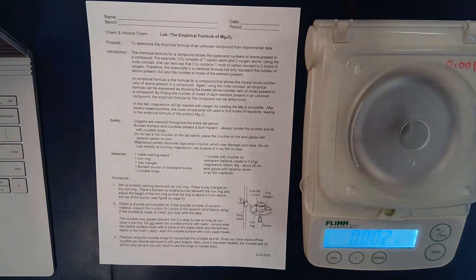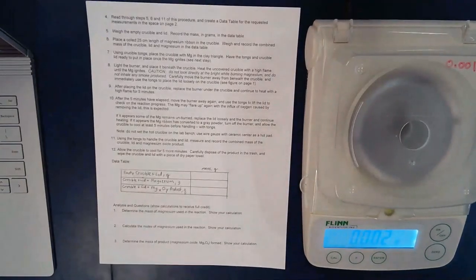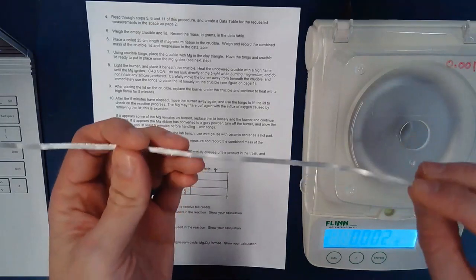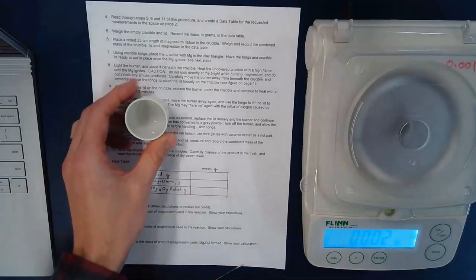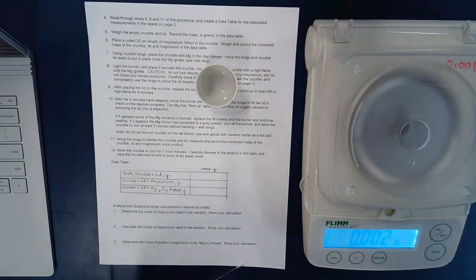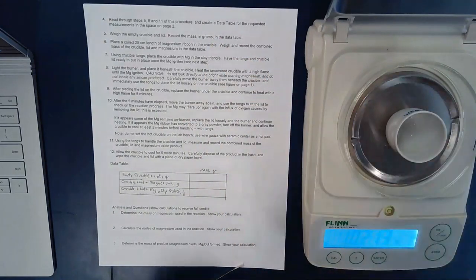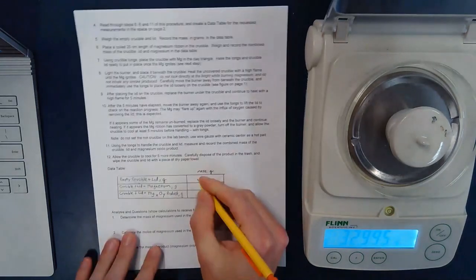Now, I think what we're going to do now is we're going to uncover our data table, and then Mr. McGinnis is going to step in, and he's going to take some mass measurements. Okay, so some of the things we're going to use, in addition to our strip of magnesium, which is a rather dullish gray metal, a little bit shiny, but sits outside for a while, it gets pretty dull pretty fast. We're going to use a crucible, which is this ceramic thing here. It is for making things very, very hot, and a crucible lid. So we are going to weigh those together, and the crucible and the lid, I get 32.995 grams.